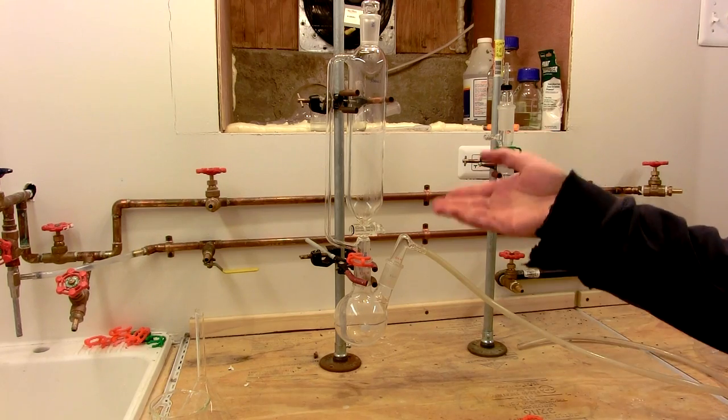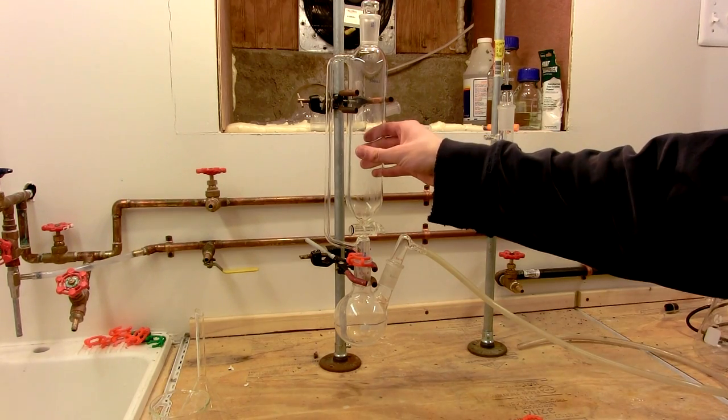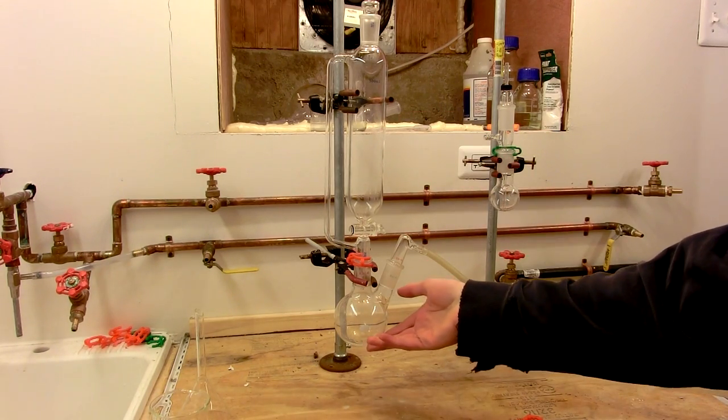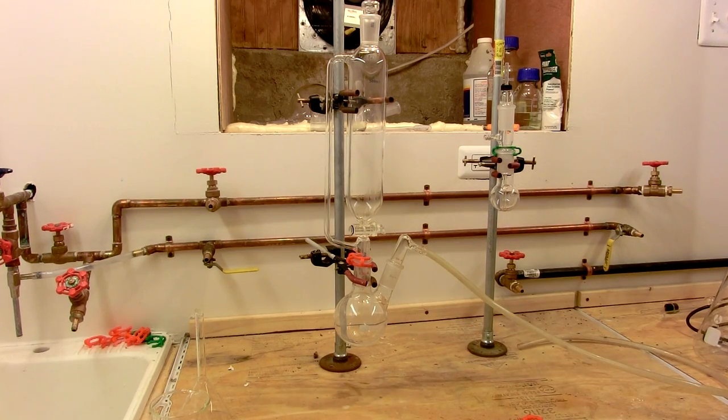This right here is a basic chlorine generator. It's a pressure equalizing addition funnel, a small flask, and a means to take a gas off of the small flask.